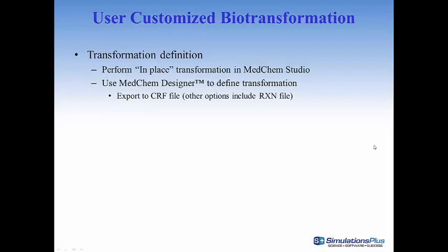The transformation can be exported to various file formats. RXN files are supported by Accelrys Draw and ChemDraw. Thus these packages can also be used to sketch the reaction.